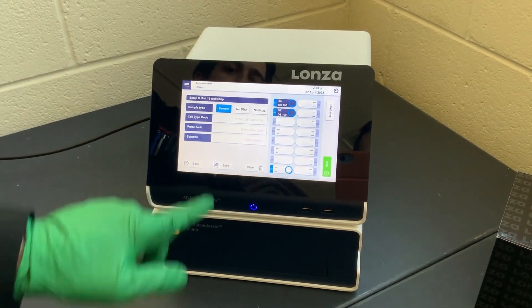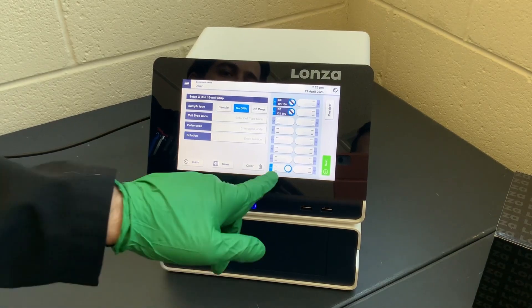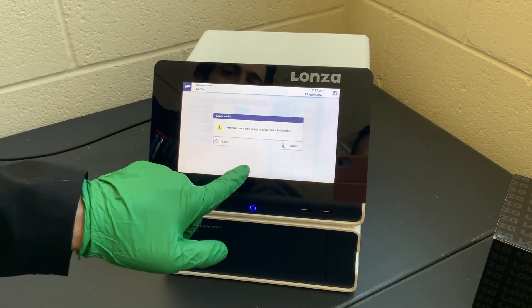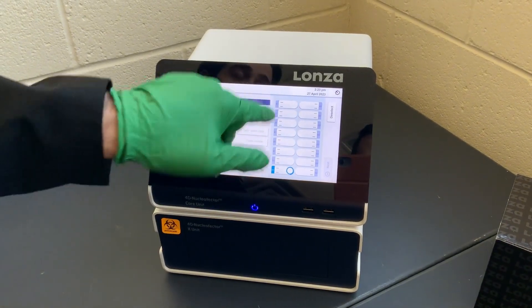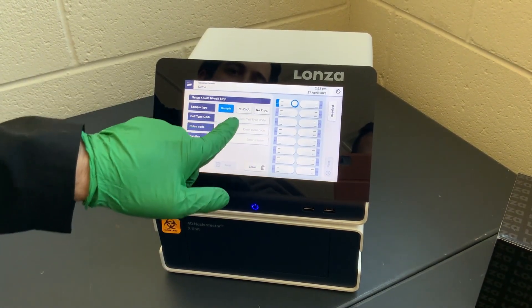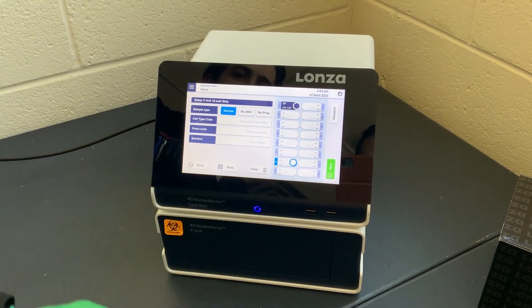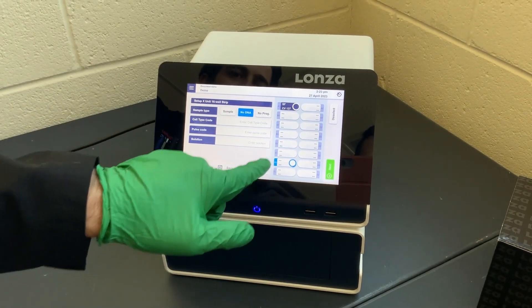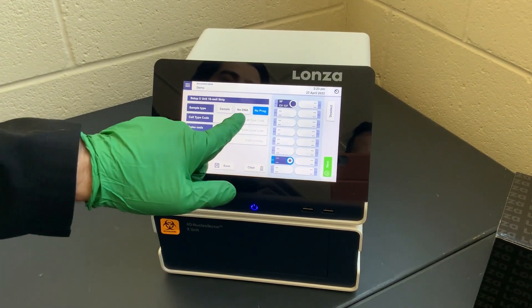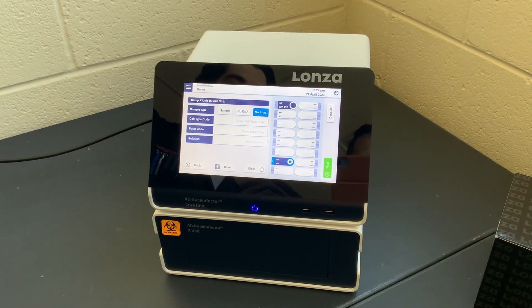You can also run a 'no DNA' condition — you can tell the Lonza machine that there's no DNA in one of your wells. Additionally, there is a 'no program' option, which means that well will not receive any electricity at all. These two options can be used as controls for your experiment. To reassign wells, you need to unselect them first and then reselect and reassign the condition.